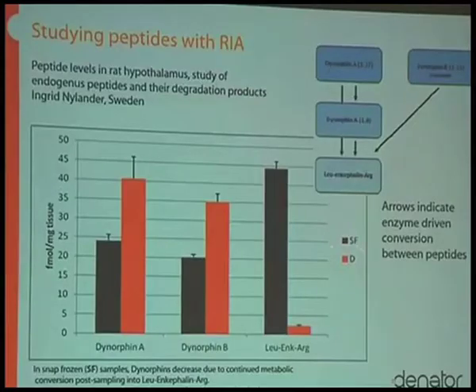The only difference with the heat stabilized is that directly after sampling, they're introduced into the stabilizer, and then they're extracted and boiled and so on the same way as the other. So despite these efforts, boiling in this very acidic 1 molar acetic acid solution, we still have continued degradation.